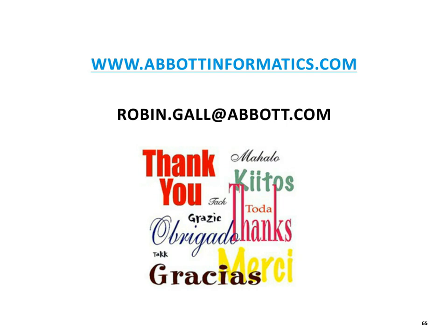Great, thank you. Tom, our next question is for you. How small can the particles be for trace analysis by FTIR? You can get down to about 2 microns.